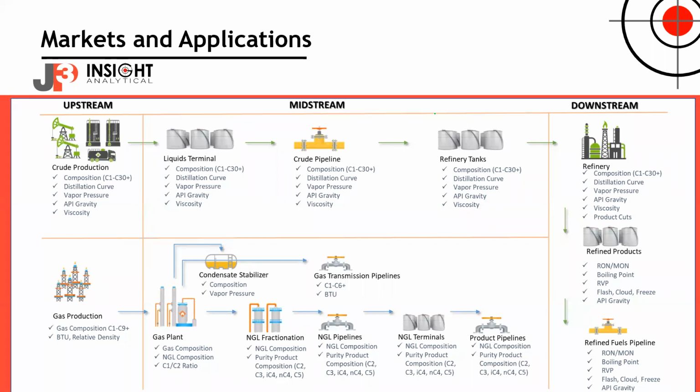where we've developed lots of models and we have lots of experience, we can, out of the chute, basically load these model sets into the analyzer before we ever ship it. And so as soon as it's plugged in, as soon as it's commissioned, it will start producing, in many cases, quite useful data at that point. And then we may simply pull some samples to validate it or to fine tune it at that point. So again, it's application dependent.